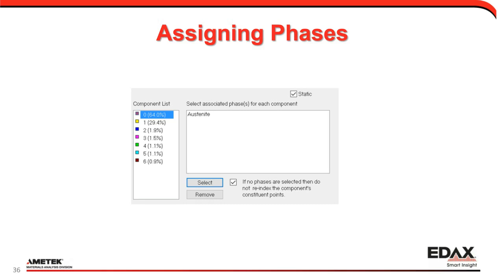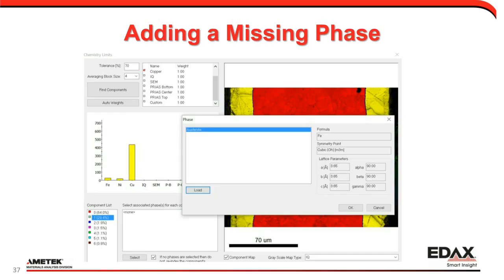Now, in this case, that copper phase, so here I clicked on phase 2, which I can see is the yellow phase. There's one of those little programmer things. You can see that the red is actually named 0, and of course this phase is actually named 1. But I can go ahead and add that to it.